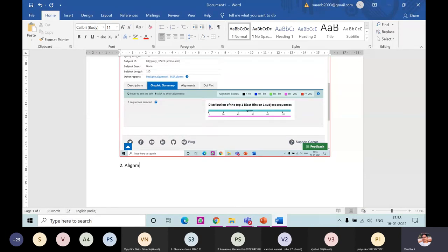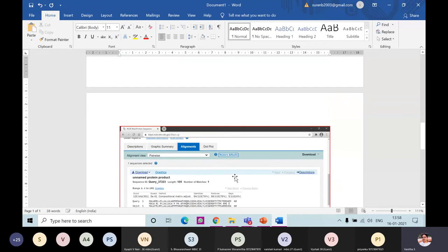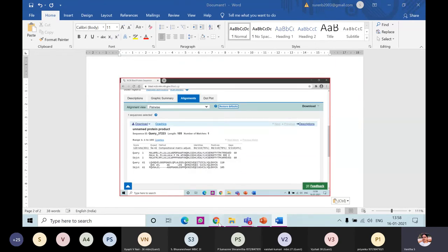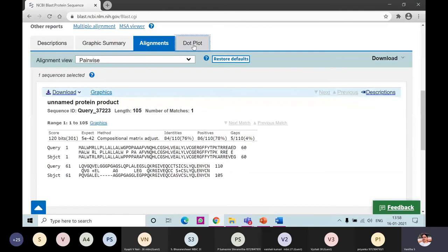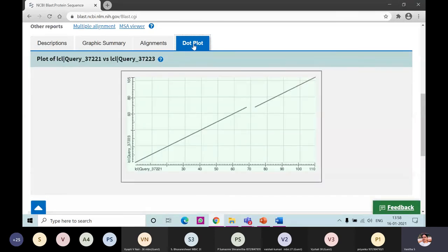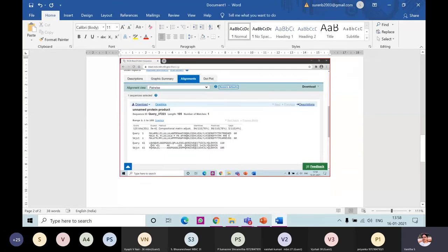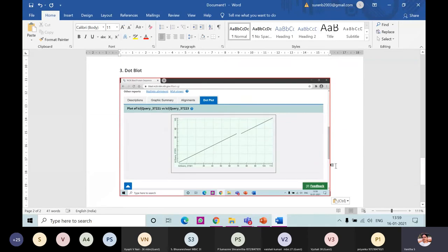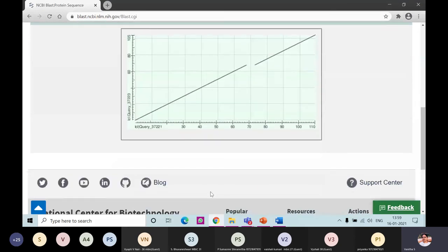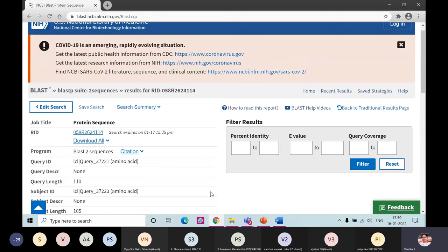Take a screenshot of the alignment result, go back to your Word document, write 'Result 2: Alignments,' and paste it. Then go back to the BLAST site and click on 'Dot Plot.' It will take a few minutes. You'll see a gap because there was a significant difference between the query and subject sequences. Take a screenshot, return to your Word document, write 'Result 3: Dot Plot,' and paste it. Your results are now complete. This is how you perform and document a BLAST comparison of two different protein sequences.